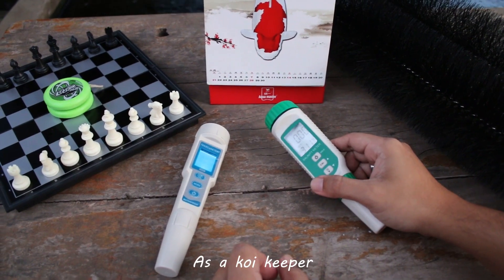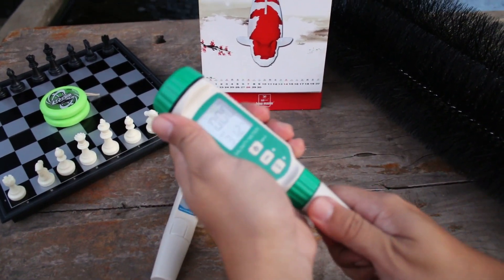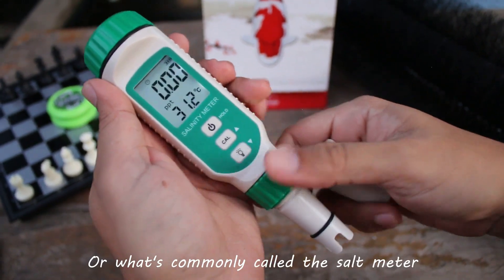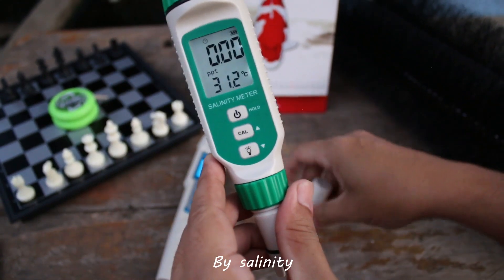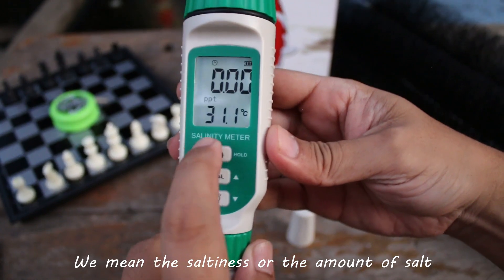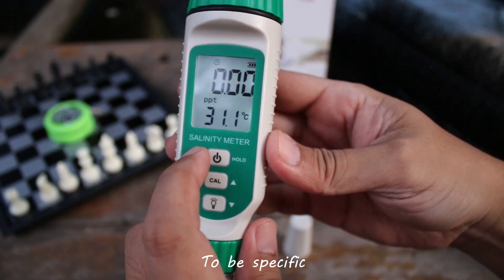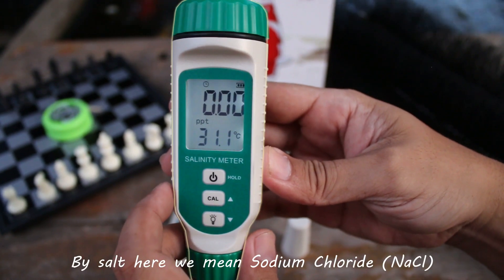As a koi keeper and fish keeper in general, our equipment of choice is the salinity meter, or what's commonly called the salt meter. By salinity, we mean the saltiness or the amount of salt dissolved in a body of water. To be specific, by salt here we mean sodium chloride.